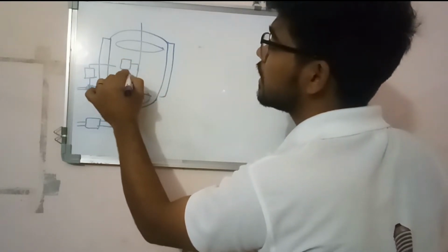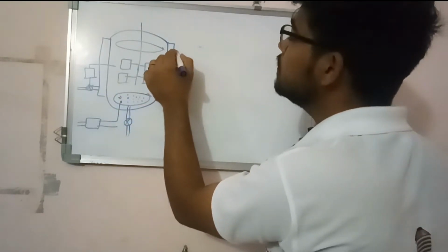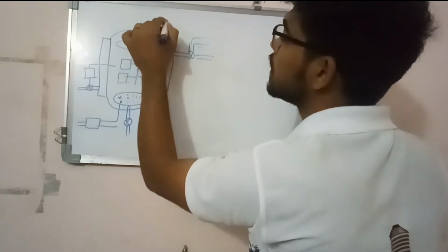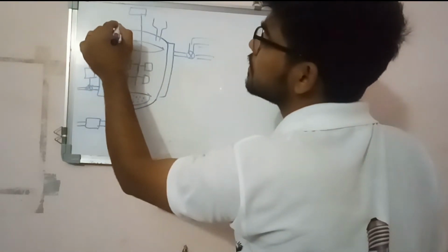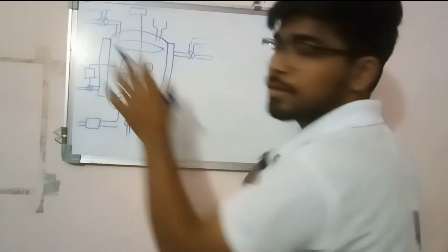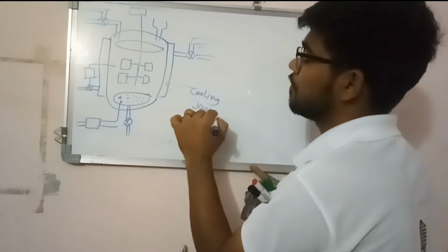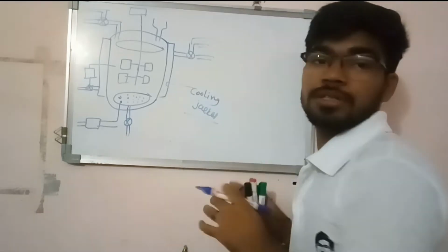This is an agitator. The other names are paddle wheel or impellers. This is the pH control. This is a motor which rotates the impellers. Here are the feed port and other things. Here is the coil, this is the cooling jacket. So we take a single part and get each and every part's information, and why it is required.